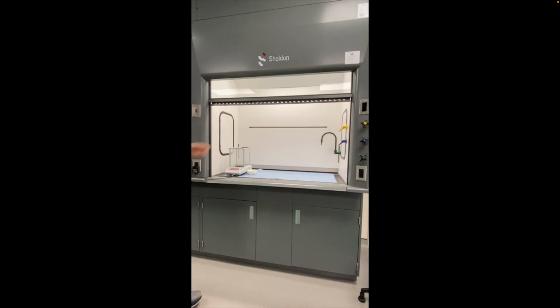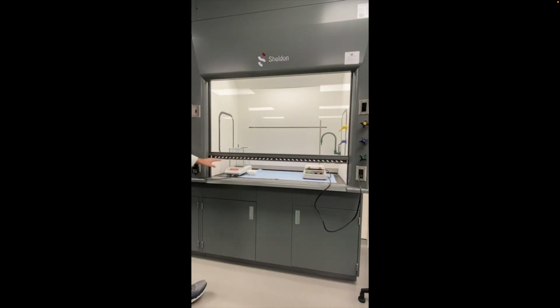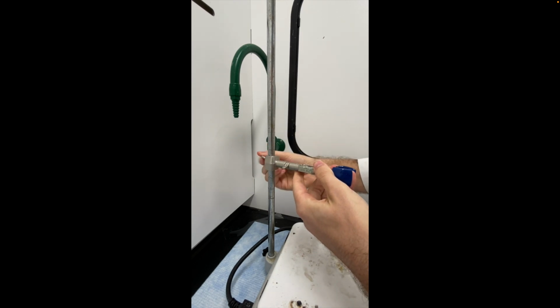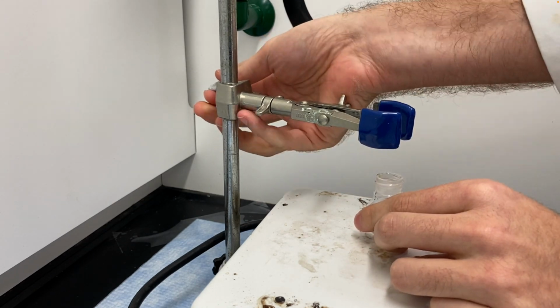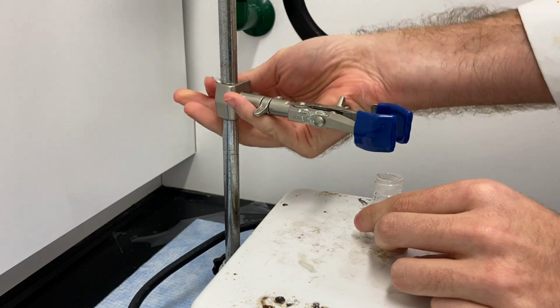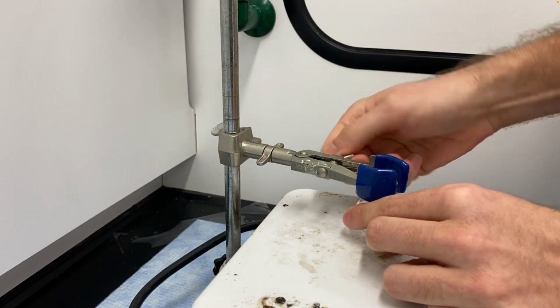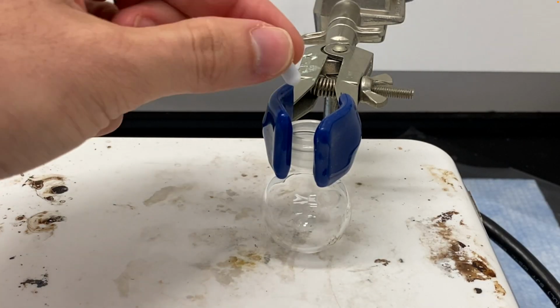So in this reaction, you're going to need a hot plate, and you'll also need a utility clamp. I have a separate video for the utility clamp. There are several different nuts on the utility clamp that you can adjust, and that controls how it attaches to the metal rod in the back, or how long it sticks out, or how tightly it's clamping onto something. For this, we need the utility clamp to keep this round bottom flask standing up. So the round bottom flask, of course, has a round bottom and would otherwise roll over.